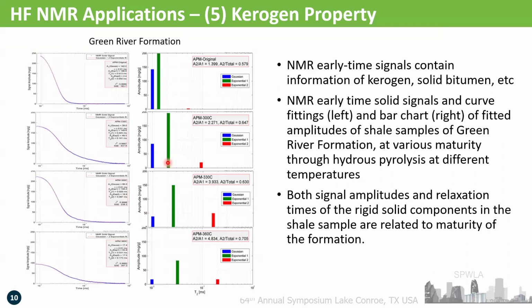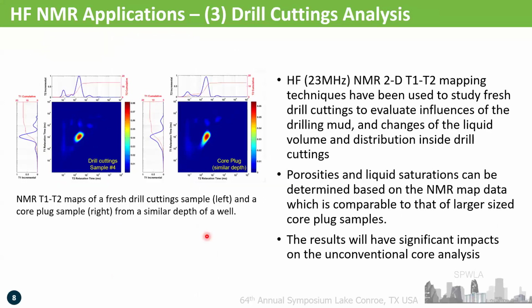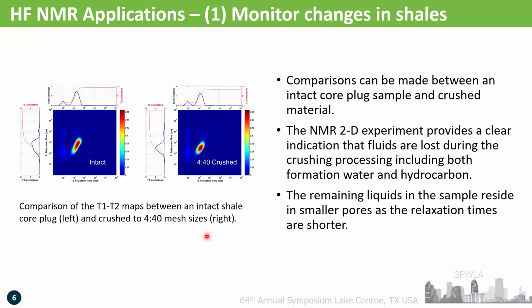I just have a sample question regarding the crushing procedures for your sample and measuring NMR after each crushing step. Do you have any standard procedure for the crushing? I mean, regarding the mesh sizes you are using to represent large, medium, and small samples?